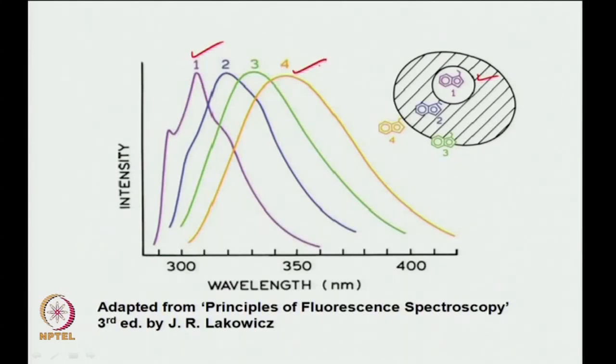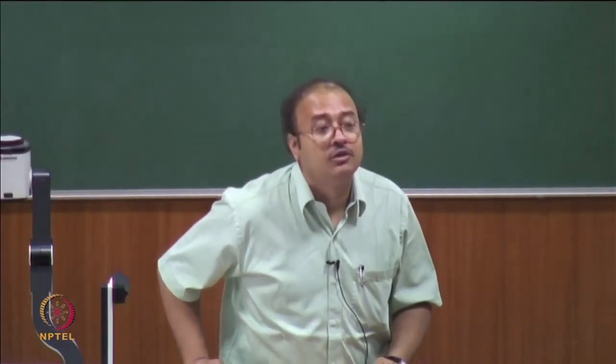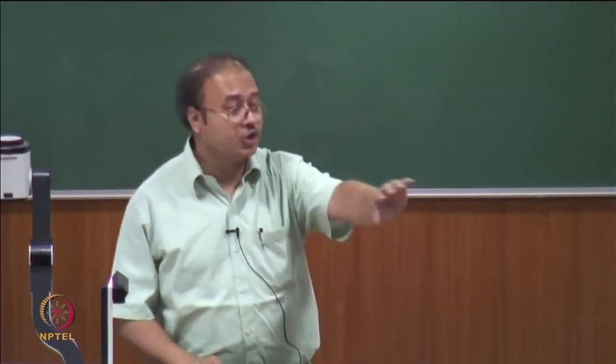Okay. Also, if you try to realize one thing, because we are already here, though we are not talking about this feature of the spectrum too much, tell me another very important difference between say 4 and 1, looking at the spectrum. Broadening. Very good. What is this broadening due to? Direct exposure. So, direct exposure to solvent molecules, right?